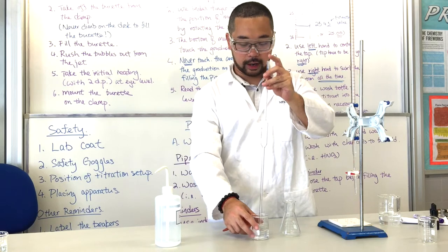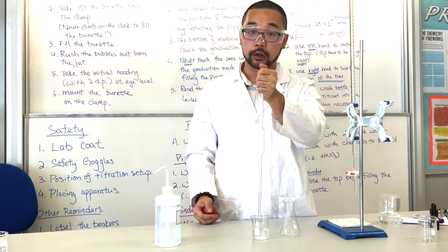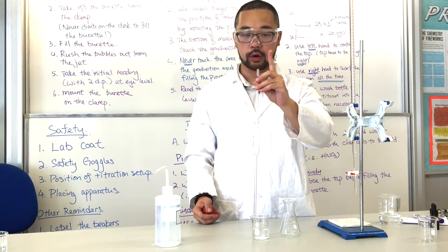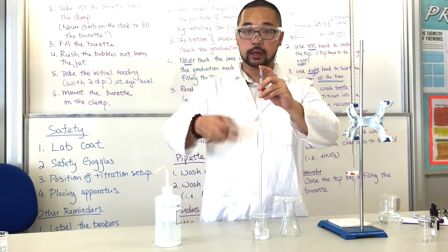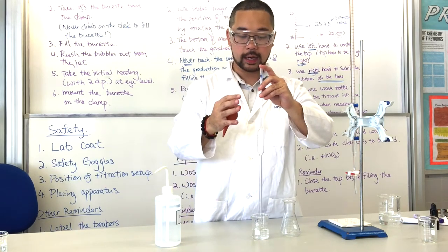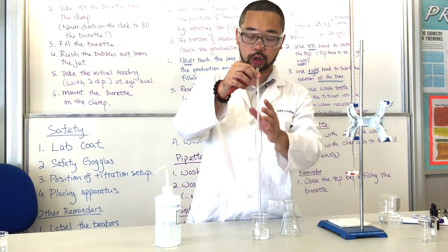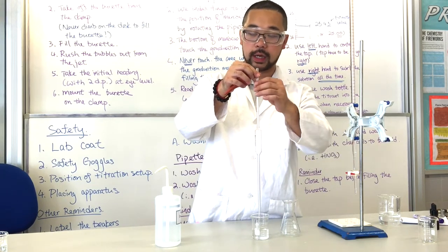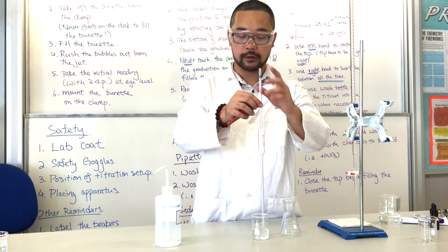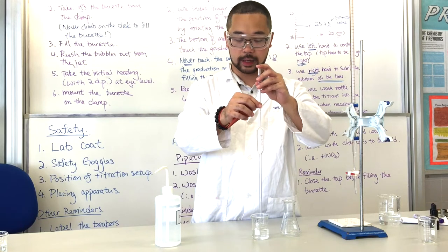And then right now, remember you should use your index fingers to cover the top, but not the thumb. To have better control, use your index fingers to cover it. And remember, during the whole process, your hand, no matter left or right, should not be touching the bottom or the lower part below the graduation mark, because this is temperature sensitive. If you touch here, the volume may expand, then the accuracy will be different.